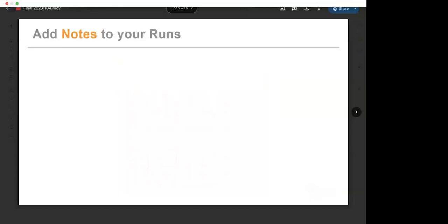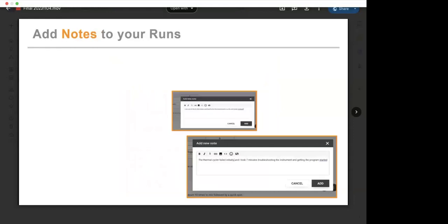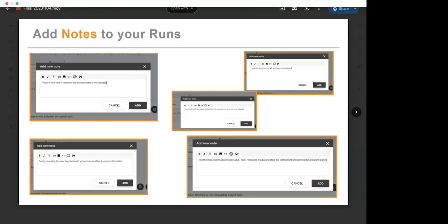When running a protocol from the protocols.io app, you can also add notes for each run. For example, if something happened and you were interrupted during a step, or you deviated from your usual routine, such as usually making a master mix and one day you didn't. If you run an experiment many times, you may not remember something that happened during a specific day, but this something can explain why the results for an experiment are different this time.